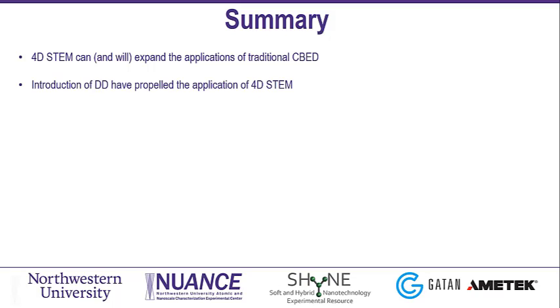So as I mentioned, this increase in usage and applications of 4D STEM is definitely a consequence of the introduction of direct detectors here, such as the K3 IS that you're going to use later today.